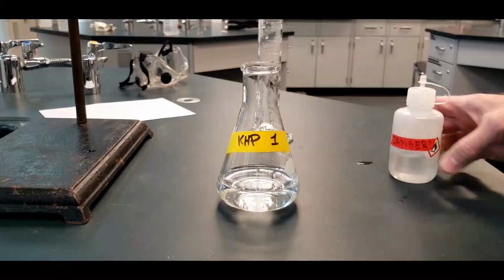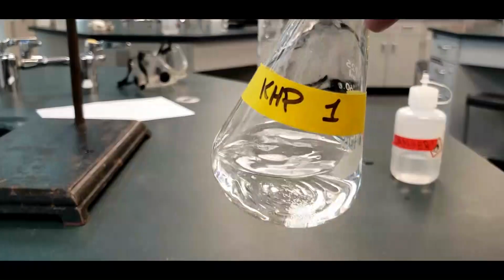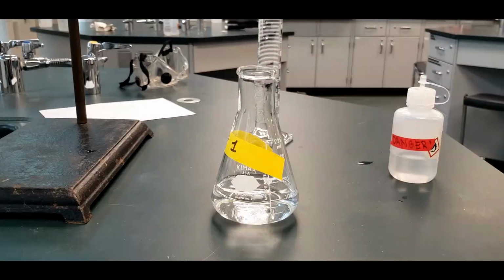And then I'm going to continue to swirl this around. You can see there's stuff on the bottom. So this will take a couple of minutes here. I'm just going to swirl it around, make sure it's all in before I start the titration.